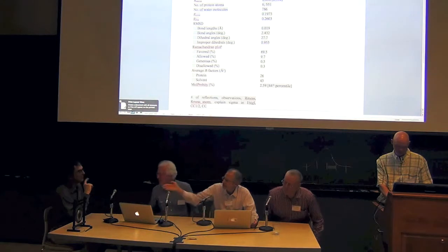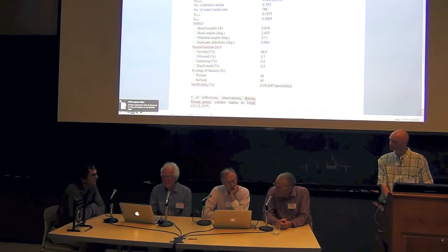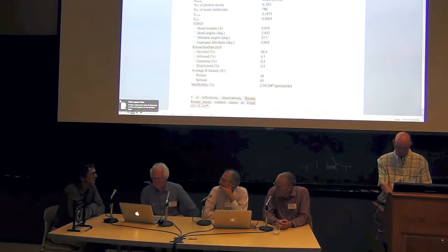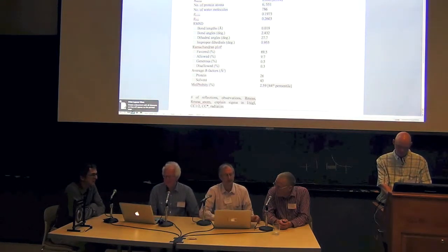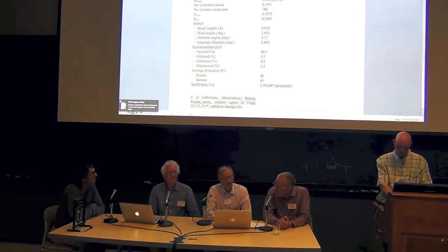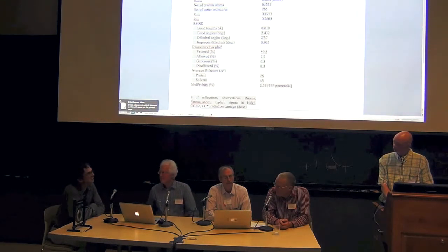I would like to add something to this Table 1, something of a very different character. One thing is to quantify the extent of radiation damage during data collection, because this is very useful. Essentially, what type of radiation dose the structure corresponds to, and what was the maximum radiation dose in the experiment, which is not the same thing. Typically, I would say that the effective dose would be about 1/3 or so of the full dose, as a rule of thumb.